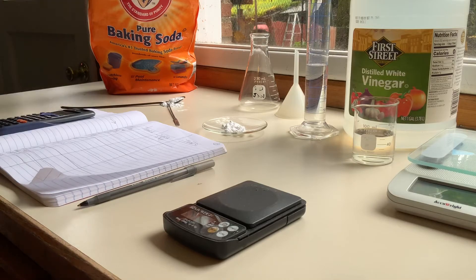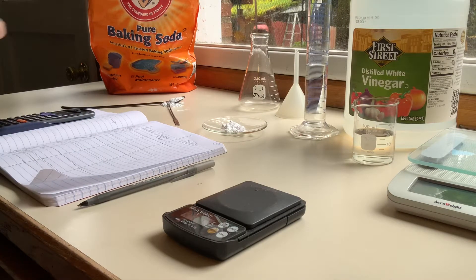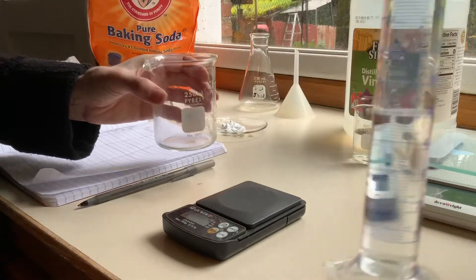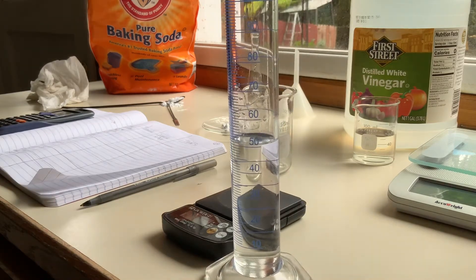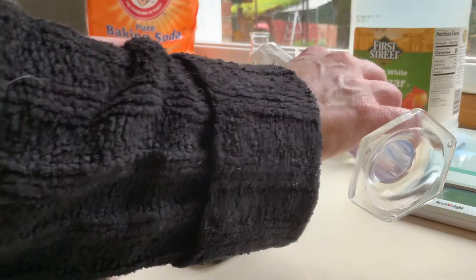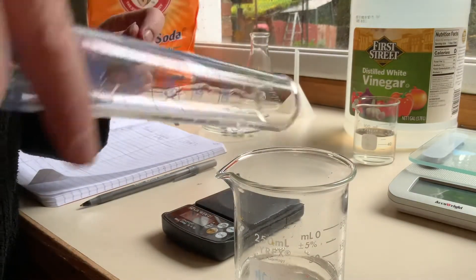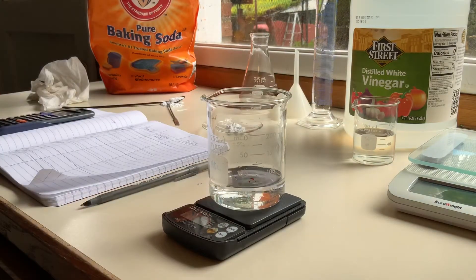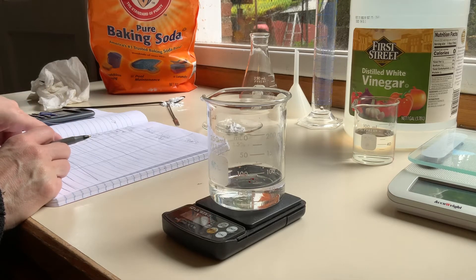I'm going to take my beaker, make sure it's dry, and re-zero the balance. In the lab we'd love to work with two decimal places but we don't get that in this case. I have my clean dry beaker and I need to add my acid. You can see I've got 50 milliliters — the camera moved to the other side. It doesn't have to be precise; we're using excess acid to make sure we react all of the sodium bicarbonate.